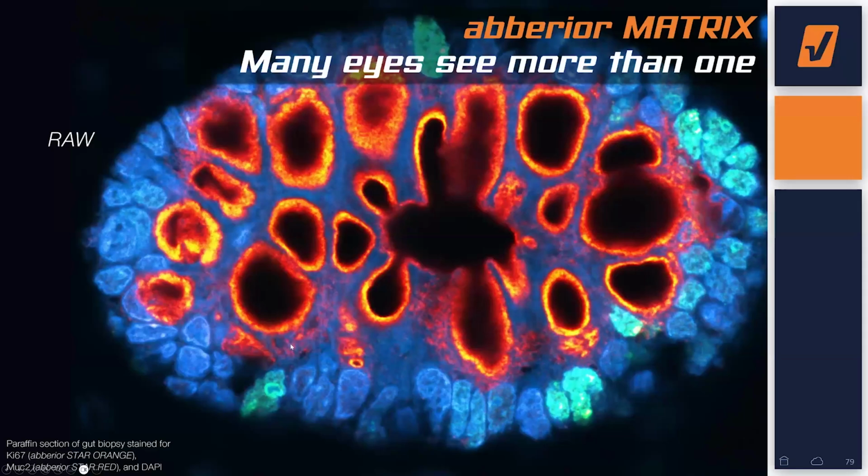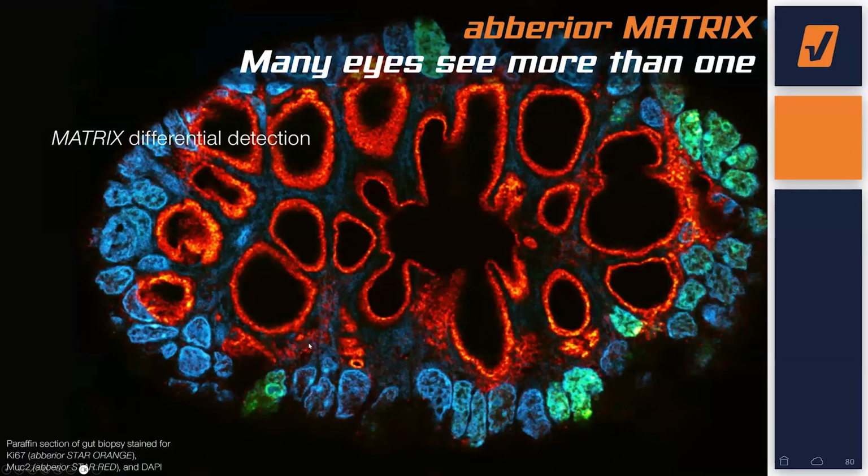Now let's see the performance of the matrix. This is the raw data of a patient. It's a gut biopsy. So it's raw data, it's a thick tissue, so the resolution is not good and the background is very high. Then we can use the matrix to boost the resolution and to remove the background, as you can see here.